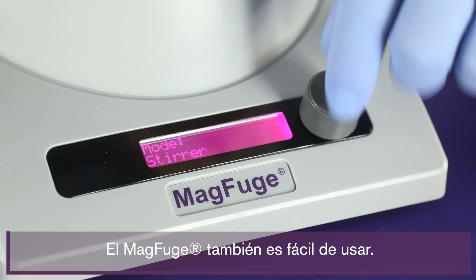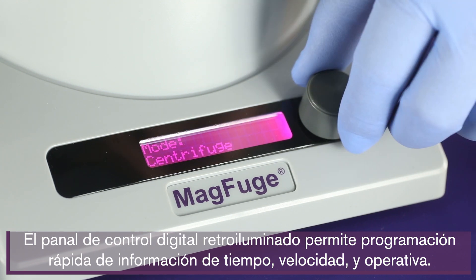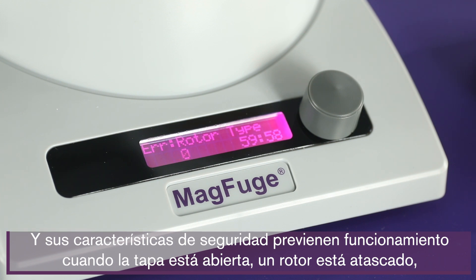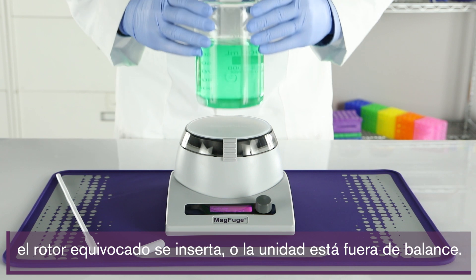The MagFuge is also easy to use. The backlit digital control panel allows quick programming of all time, speed, and operational information. Its safety features prevent operation when the lid is open, a rotor is jammed, the wrong rotor is inserted, or the unit is out of balance.